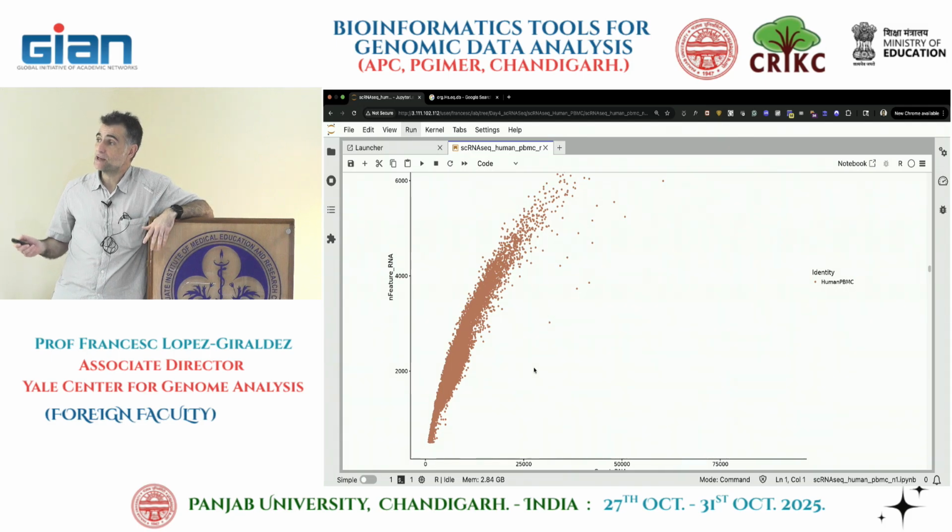Also, by the way, here we already removed cells when we pre-filter, right? When they don't have enough transcripts and genes, we remove this section here. You don't see cells with a very low number of features or genes because we remove them. But this top section here, we generally filter out, trying to filter the doublets because we are losing that linearity and it's starting to have a curve. So you're sequencing more, but you don't see more genes.